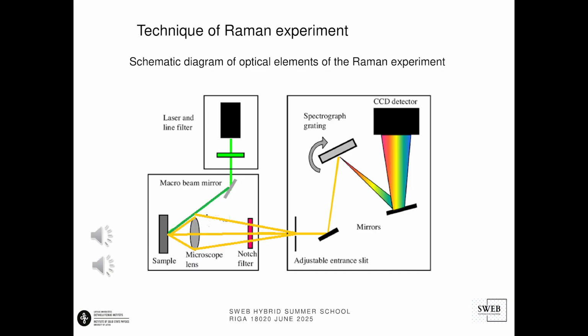The monochromator, laser and sample chamber are the main components of a Raman spectrometer. The laser line filter offers maximum transmission of laser emission, while eliminating noisy spontaneous emission. The laser beam is focused on the sample. The lens focuses the scattered radiation onto the entry slit of the monochromator. The notch filter is used to suppress Rayleigh radiation.